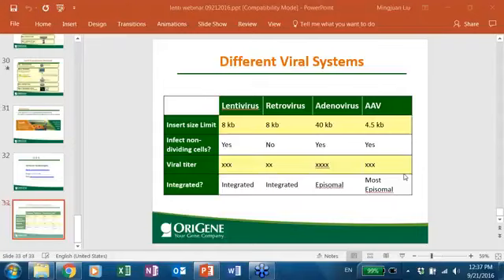The question asks, if the lenti integration is random, how can there be silencing, knocking down, of a specific gene? Yes, after integration into the genome, the shRNA will be expressed, and the shRNA is gene specific, able to target the target gene mRNA, so the target gene will be silenced. Sorry, I didn't get the question at first.